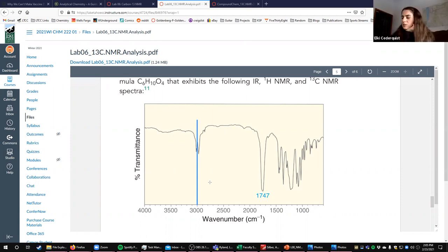And right, this one's right. So there's peaks on both sides, right? Yeah. So that means that you've got some carbon hydrogen bonds that are sp3 and some carbon hydrogen bonds that are sp2. So in other words, you've got alkene or benzene, and you've also got some alkane in there too.